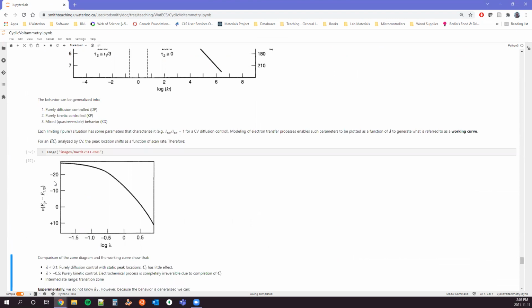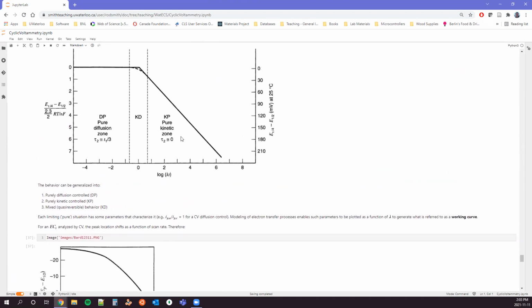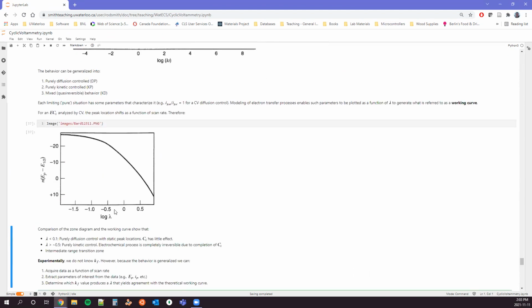We can start looking at this and applying this. And so the key here is that this is a map. Because it's dimensionless, we can use this as a map. And so we have a kinetic parameter and a thermodynamic parameter. We can plot that kinetic parameter versus a thermodynamic parameter for our electron transfer reaction in cyclic voltammetry.